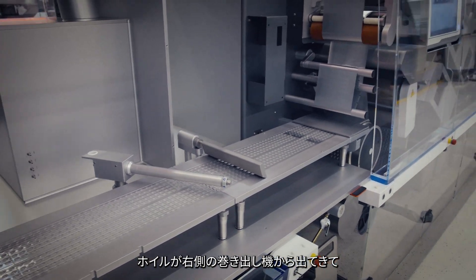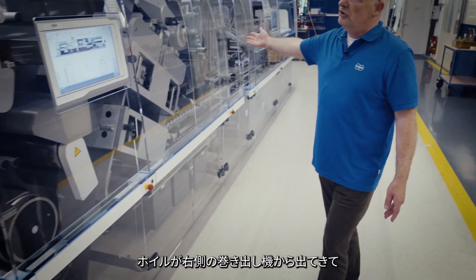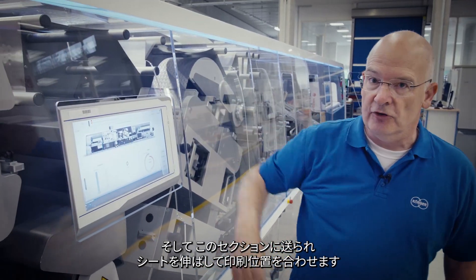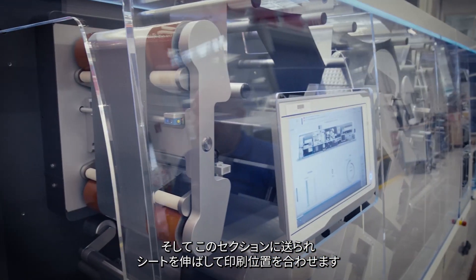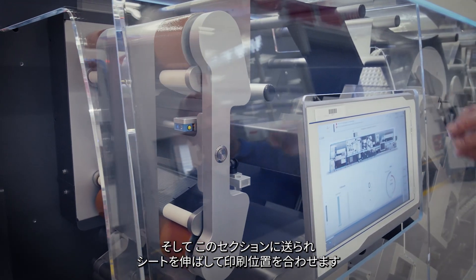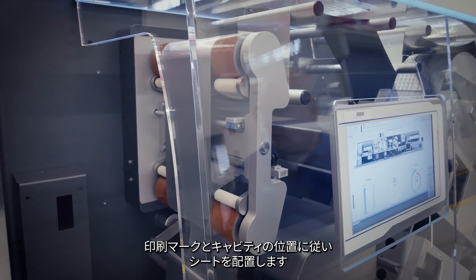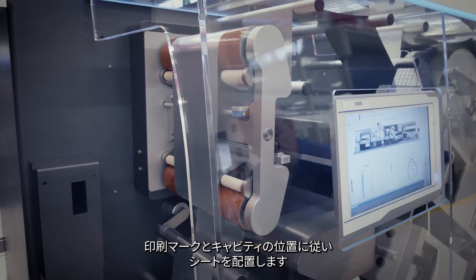Lid foil is coming from an unwinder to the right of the machine. Lid foil passes through the machine safely, always under cover, and is then presented to this section where we can align the print by stretching of the web. Two servo-driven draw-off rollers are aligning the web, following the print mark and the cavities position.